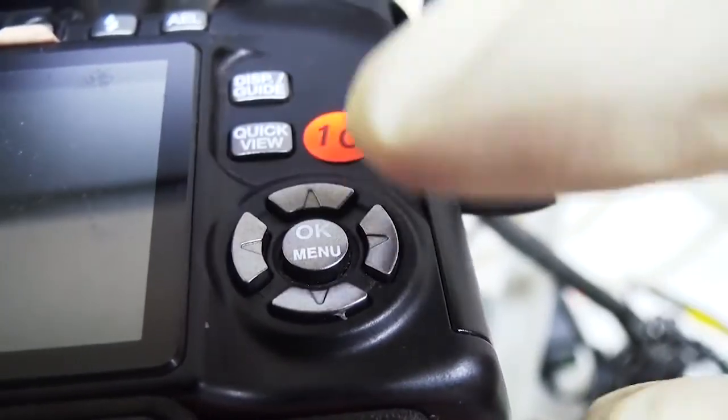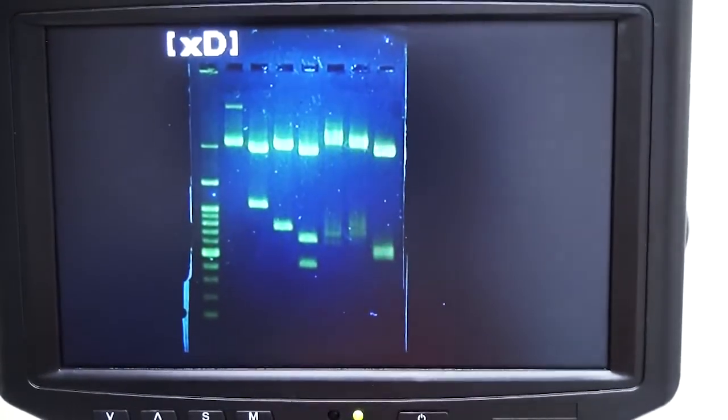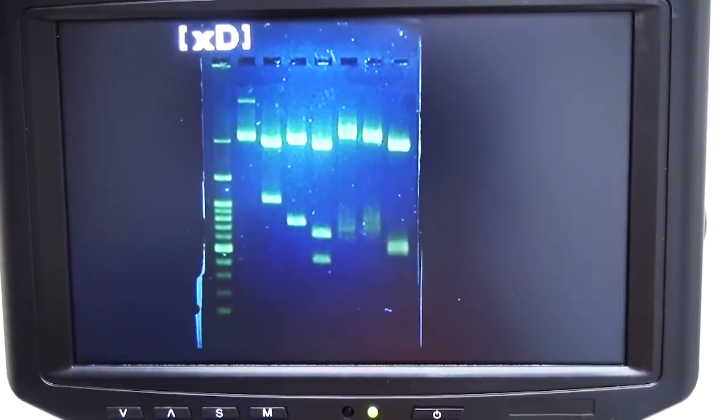Preview the image. Take note of the file names and download the images. If the image is under or overexposed, adjust the shutter.